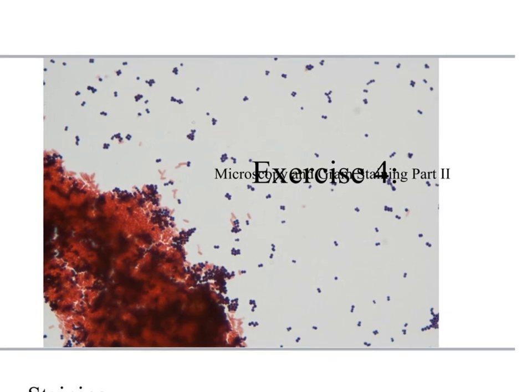Our gram-positives, I think they're Staph epidermidis, is what is in the mix. They're going to be these purple round cocci. Cocci is our name for round cells. The E. coli are the gram-negatives, and they're going to be these pink bacilli, these pink rod-shaped cells. So a good gram stain has very distinctly purple and distinctly pink cells.